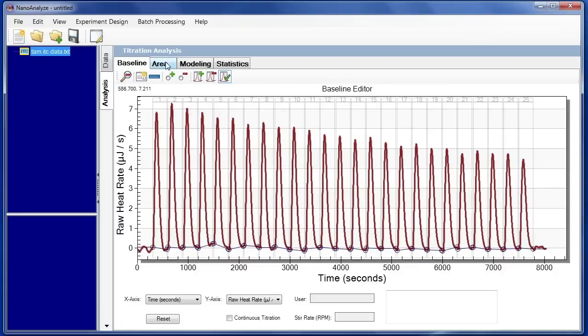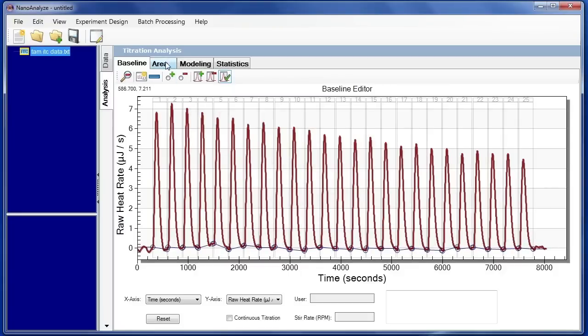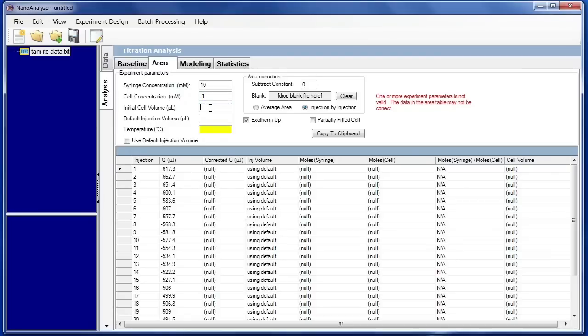The next step is to click on the Area tab. And type in the concentrations that were used for this particular experiment. As well as the cell volume. This isn't the actual volume of the cylinder that was used. But the volume of the material that was loaded into the cell.